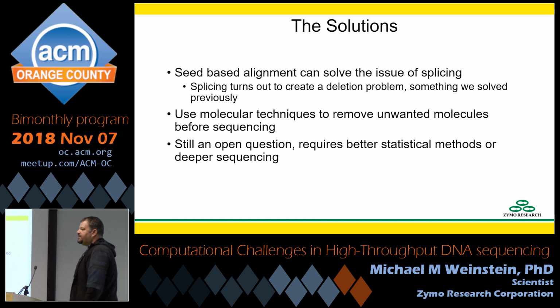As far as dealing with low abundance molecules and limited read depth, that winds up being a mathematical problem. Essentially, with low abundance molecules, you'll have a lot of hyperdispersion where you'll just see a lot of variance, because you're taking a limited sample of something that's rare. So if you miss 1 or 2, that can have a big effect on how much of it you estimate is there.